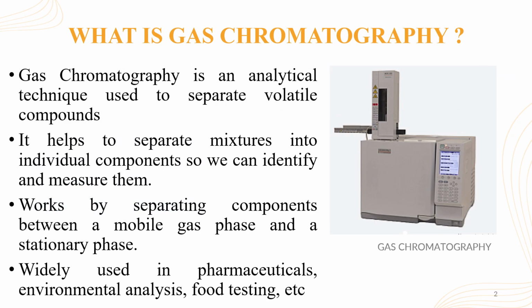Gas chromatography is an analytical technique used to separate volatile components. Gas chromatography helps to separate mixtures into individual components so that each component can be identified and measured separately. It works by separating the components between a gas phase and a stationary phase. Different components move at different speeds, so separation takes place. Gas chromatography is widely used in pharmaceutical, environmental analysis, food testing, and research laboratories.